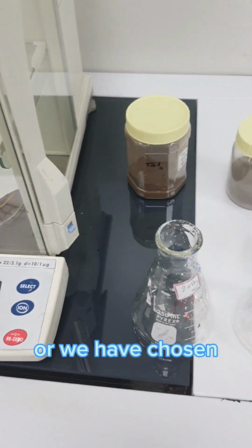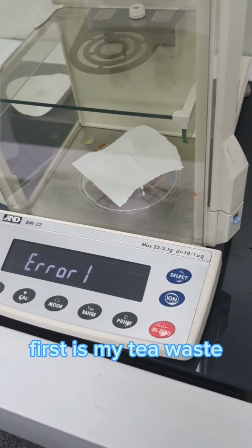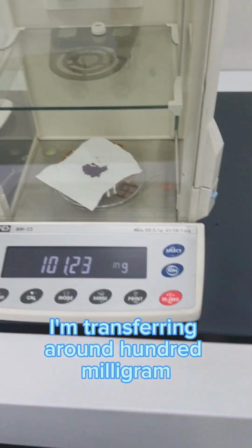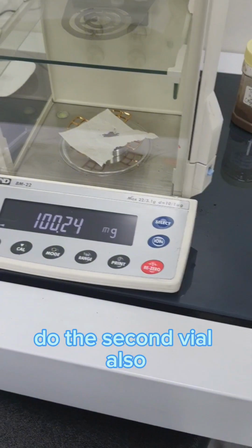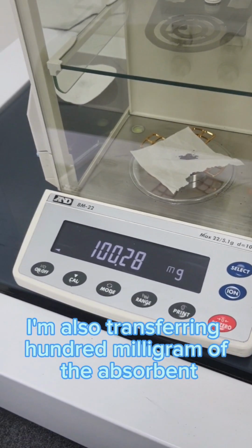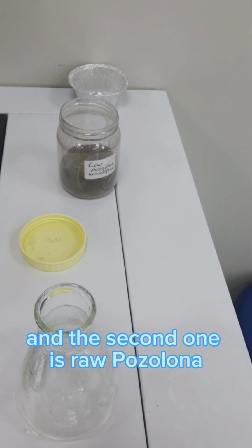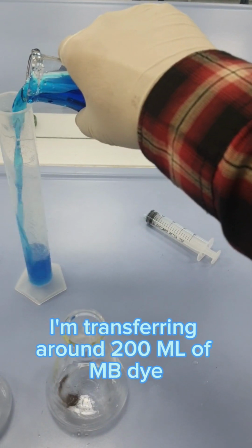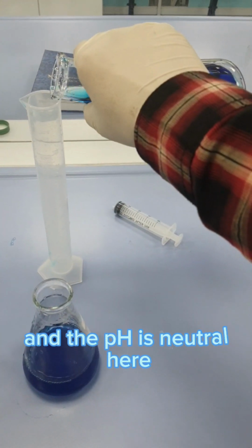Now we have chosen two different kinds of adsorbent for regeneration. First is my tea waste and second is my raw pozzolana. I'm transferring around 100 milligram of both adsorbents into the conical flasks. So the first adsorbent is tea waste hydrochar and the second one is the raw pozzolana. The next step is to transfer an equal amount of methylene blue, around 200 ml, to the vials. We know the concentration of the pollutant and the pH is neutral here.